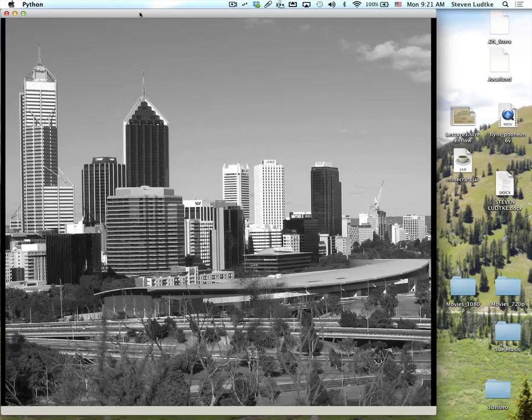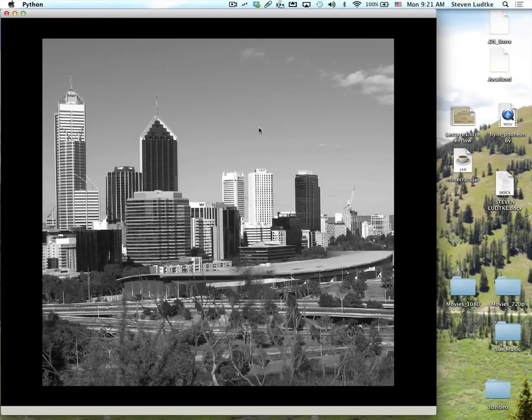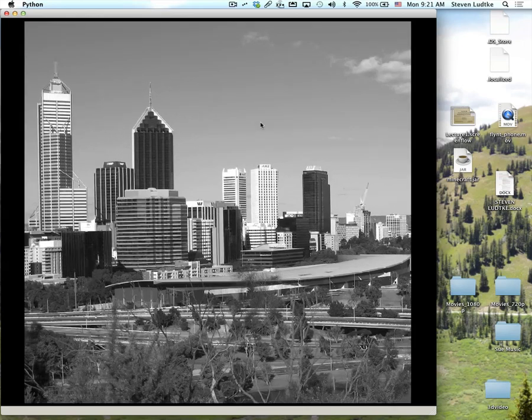But no color. If you have multi-channel images, say you're doing fluorescence and you have several different fluorophores that you're recording, you'll need to load them as separate images, not just treat them as one color image. So if you read TIFF images in, it'll turn it into a black and white image if it wasn't already.